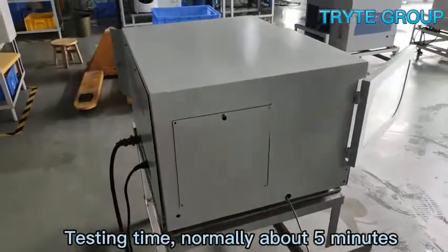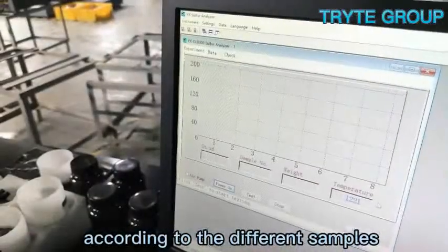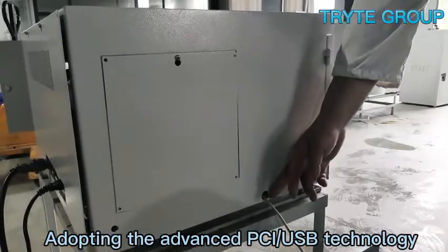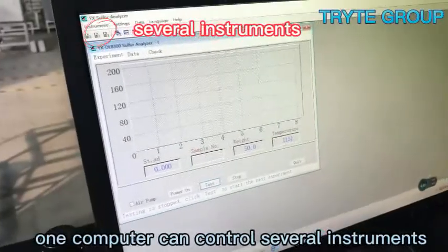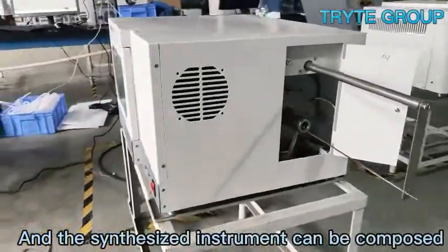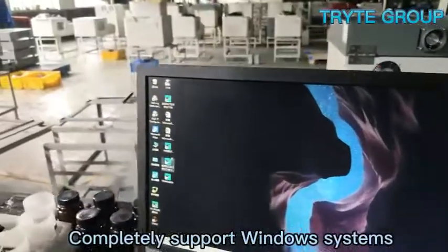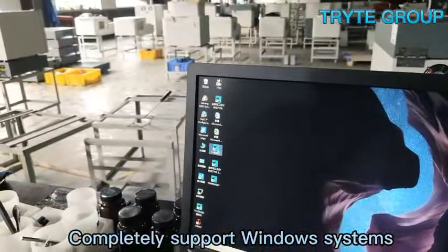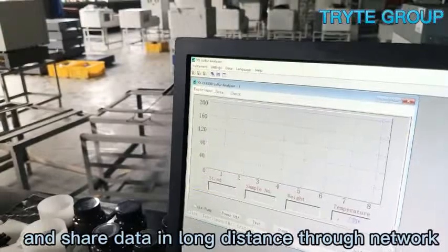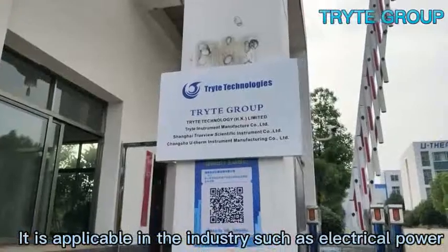Testing time is normally about five minutes and can be automatically judged according to the different samples. Adopting the advanced PCI-USB technology, one computer can control several instruments, and the synthesized instrument can be combined with other instruments. It completely supports Windows systems, offers high stability, and can link to an electronic scale and share data over long distances through a network.